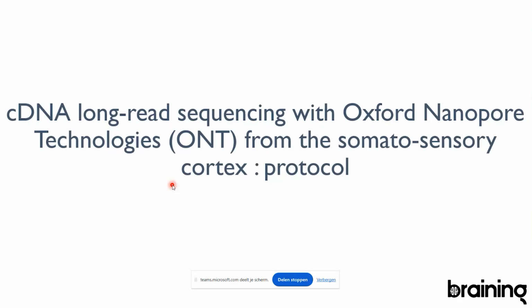So actually, once the protocol is ready, we will ask you, Martin, for the revision, and then the revised protocol lands on the project website. That's the idea. Okay. Yeah. Very good. So what I propose as a protocol, I mean, it's quite specific, would be to look at copy DNA through nanopore sequencing, specifically from the somatosensory cortex in the brain.